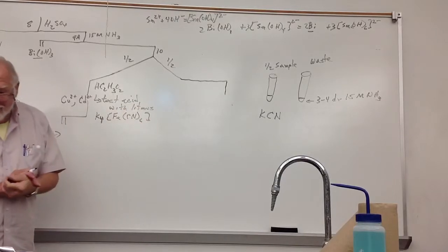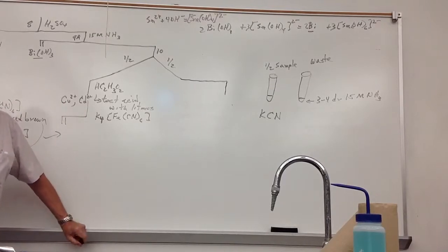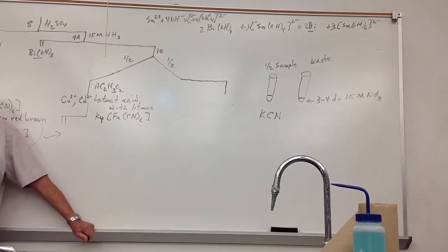They're not doing it intentionally. They just say, oh, I'm supposed to add acetic acid. And now they're giving me a test tube that's been acidified. And as soon as you add KCN to acid, it makes HCN gas. You smell almonds for a few seconds and say, oh, that smells really nice. It's curing my cancer. Whatever they say about almonds. Anyhow, it cures a lot of things.